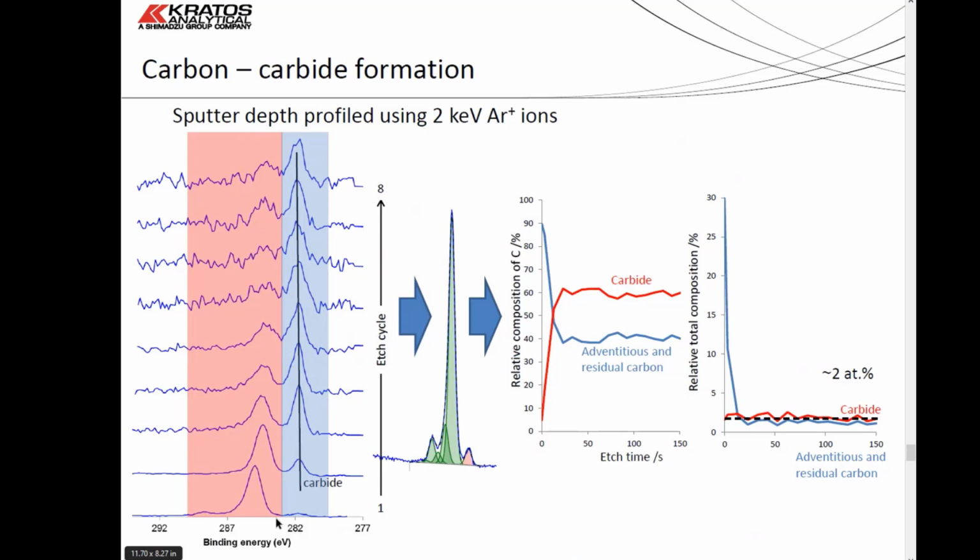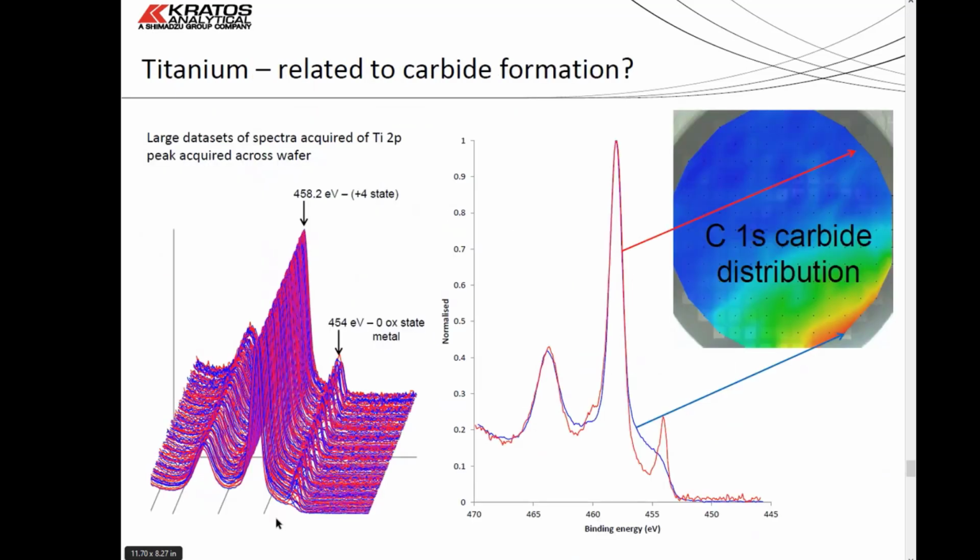So that was interesting for them because then they could look at the XRD data for the map of the same thing, and they could see carbide in this region and not in the other. So it fitted with the kind of peak identification that they'd seen. So that was one of the nice things, when it all kind of knits together and works. It's kind of neat. But obviously we've been told that there's carbide there by working up this big data set. So what carbide was it?